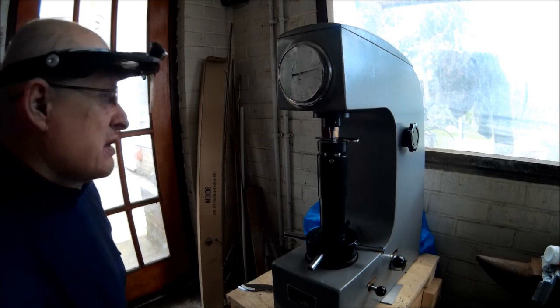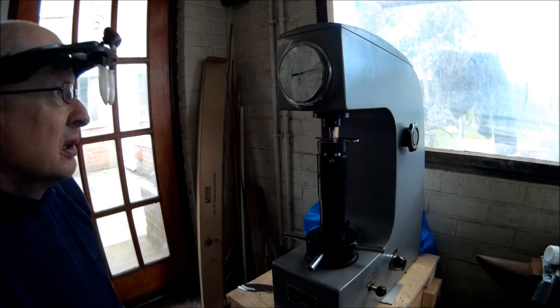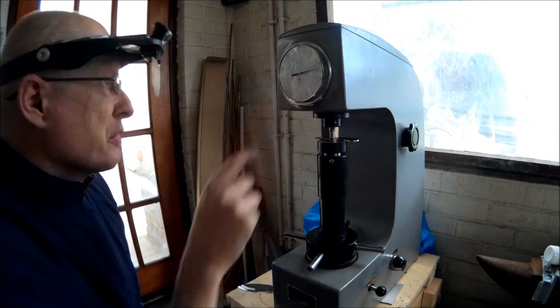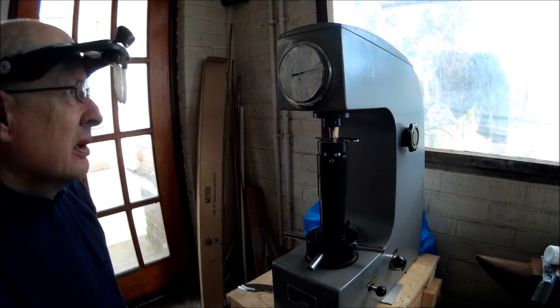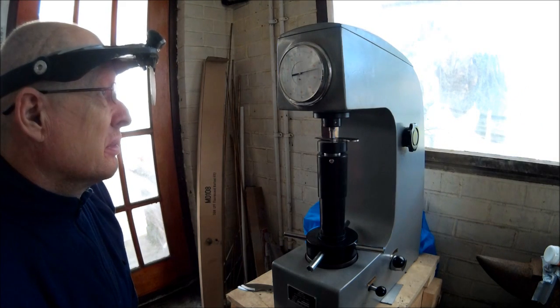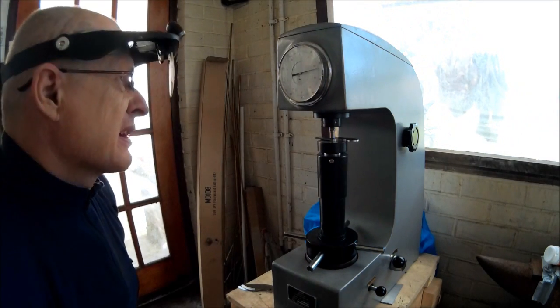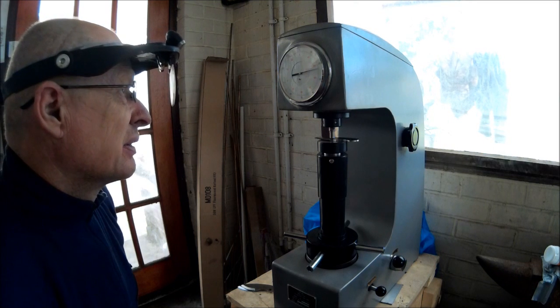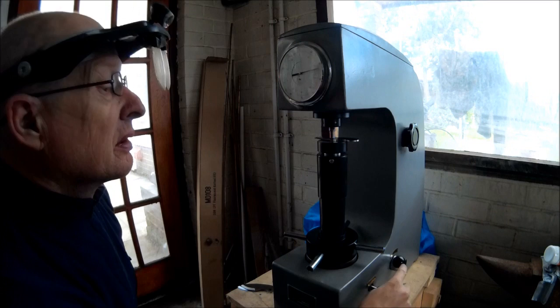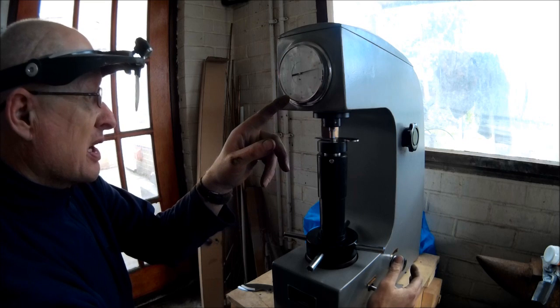Now it's a matter of waiting just for a few moments to let everything settle. I don't want any movement at all in that needle — I want to make sure it's completely settled and found its position. I can't see any movement on it at all now. It's quite a fine needle and you can see any slight movement over a 30-second period. It doesn't seem to have moved, so now I'll use the loading lever again to take the force off. As I remove the force the needle will swing round and give me my final Rockwell reading.